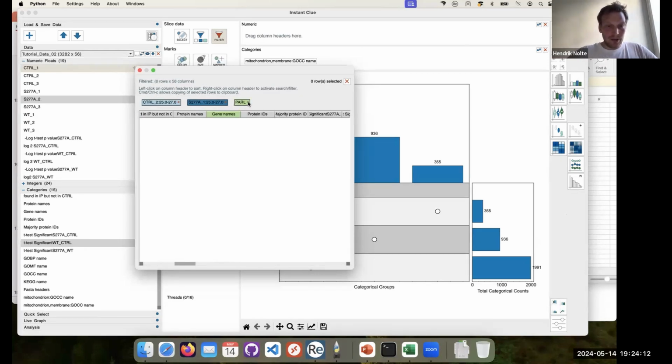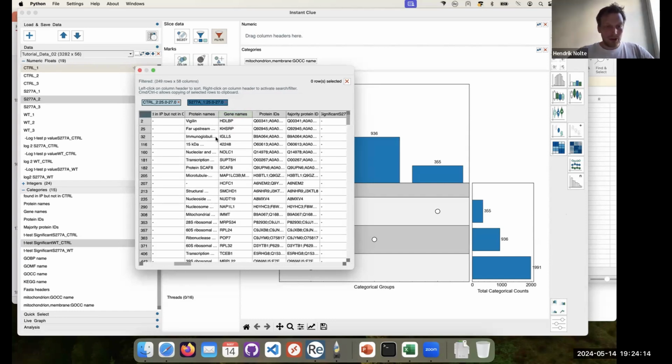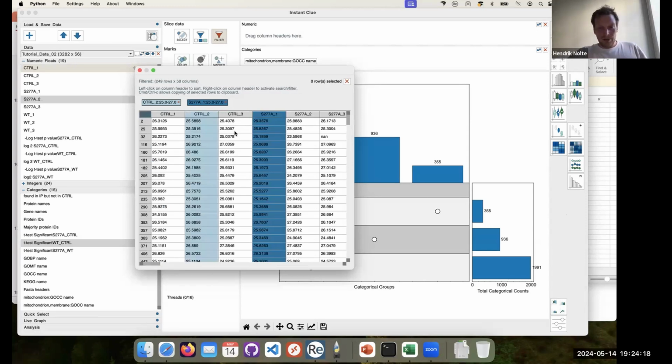Okay, it doesn't fit now, this filtering, but you can search for strings and for numeric data, nicely seeing already the result, how many you have. I think in the setting you can set, I'm not 100% sure if it should be considering this as "and" or "or", but at least you have a nice visual result already of your filtering. And then more importantly, you can either go here and say add as a new data frame, and then it adds this as a new data frame.